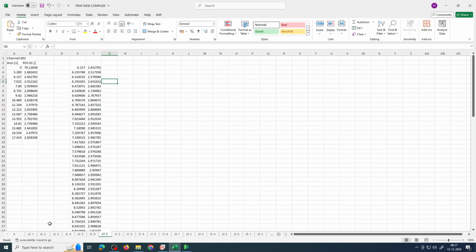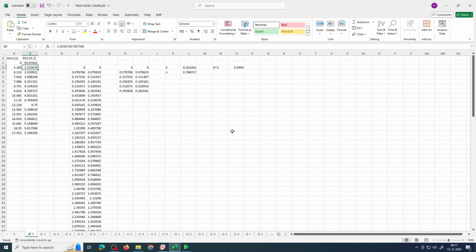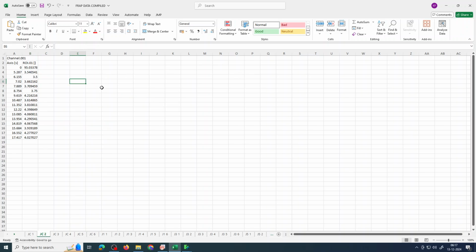Now these are actually the replicates. Suppose you have 5 technical replicates. So how will you plot in that case? So this was my calculated value. Let's say I have already calculated it. So what to do in the next part? How will you calculate this part?